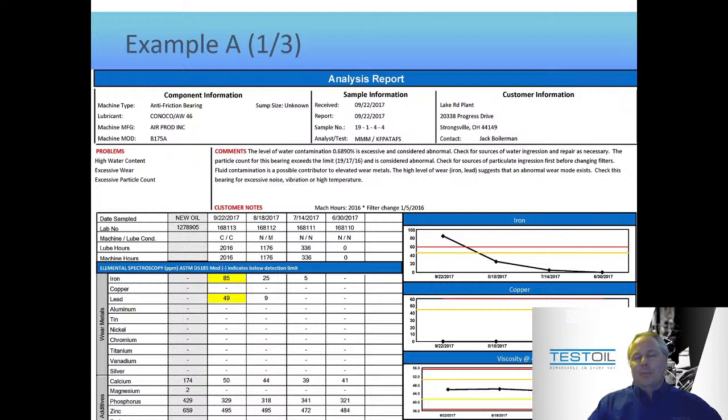And like I said, this is the part that takes patience. Because again, as soon as people go on to the next part of the report, they immediately think I mean the data. And I still don't mean the data. In the next part of the report, just below the header there, you see all the information directly related to the sample that would have been provided by the end user.